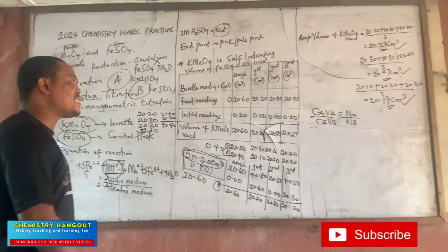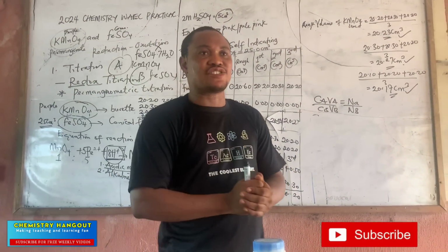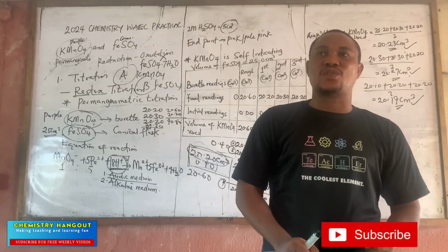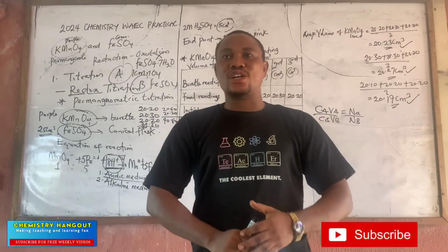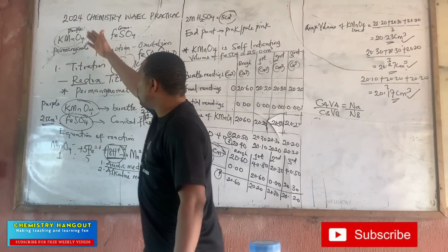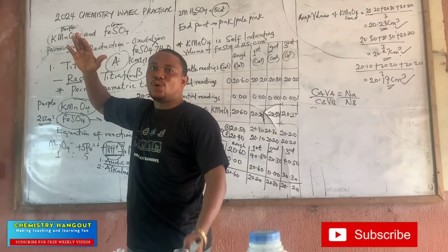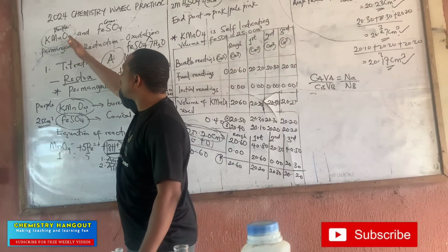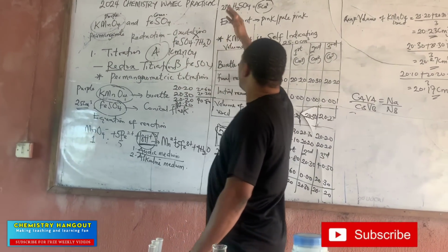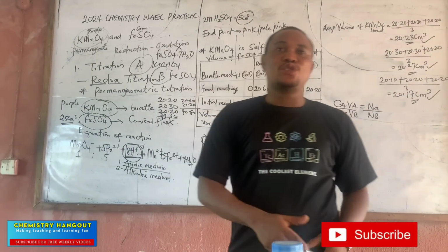So, guys, that is that for titration. I'm still coming with my predicted questions for titration and for qualitative analysis, but I just have to do this for teachers. I want to believe you should know how to prepare this. If you don't know that, you can reach out to me. You should know how to prepare 2 molar H2SO4 and how the reaction and the titration will go.